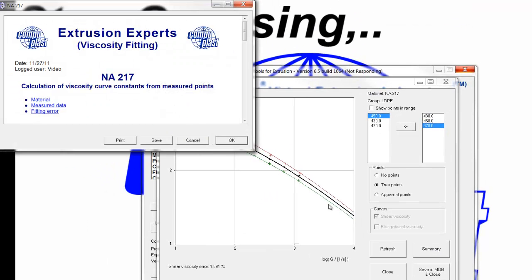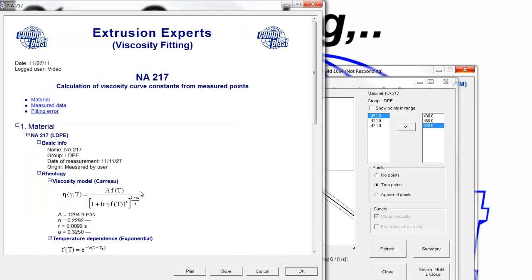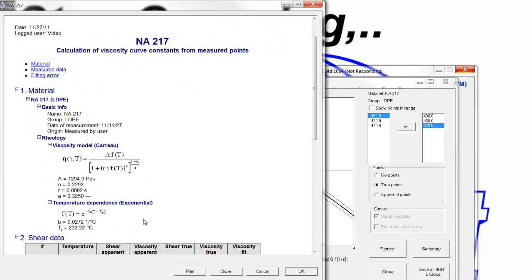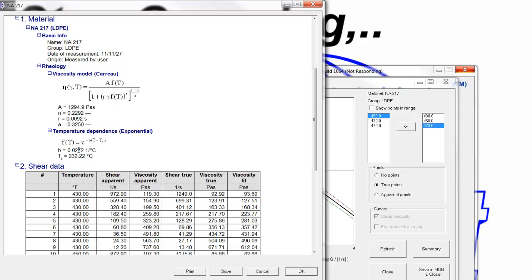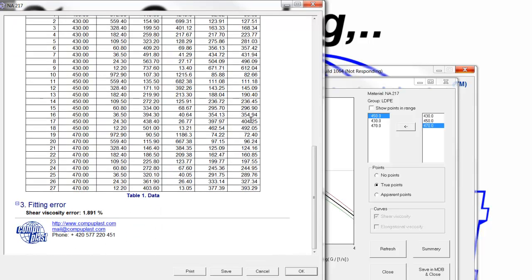We can look at a summary. The summary has the main information of the fitting: the model that was used, the parameters that were determined, and it shows here the temperature dependence parameter was not applicable. It calculated the shift factor, and now we have the true viscosity and fitted viscosity so we can compare how close those are, and of course we have our error there. We can print or save this file to use it for reference.